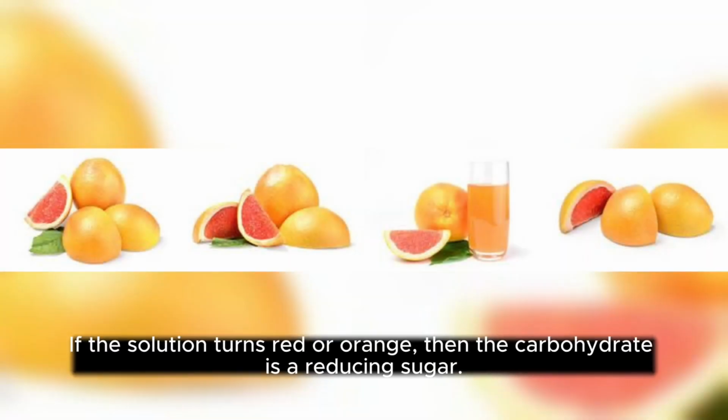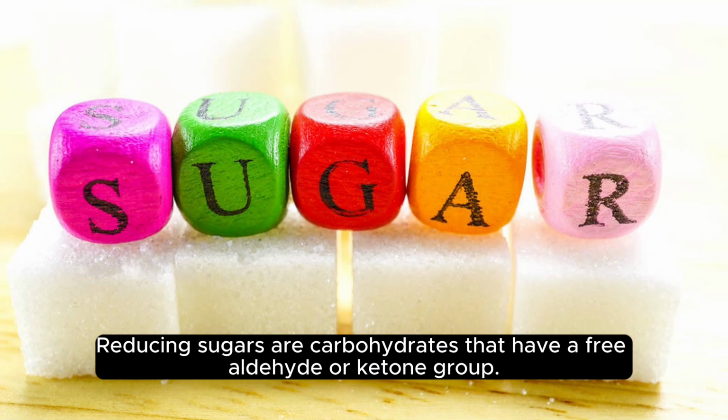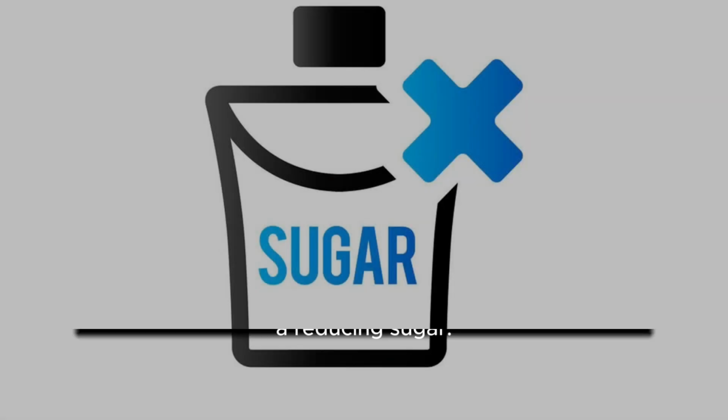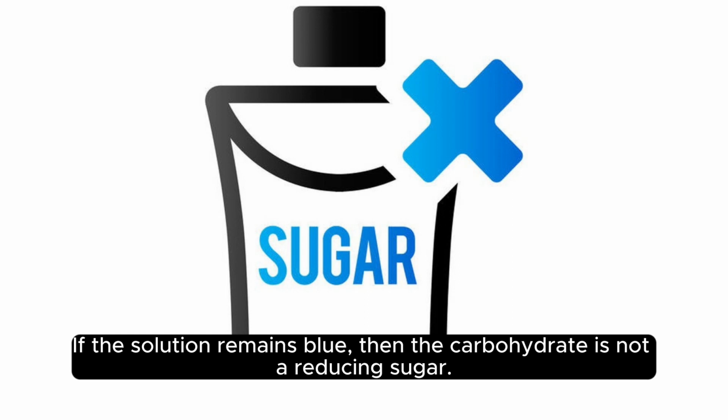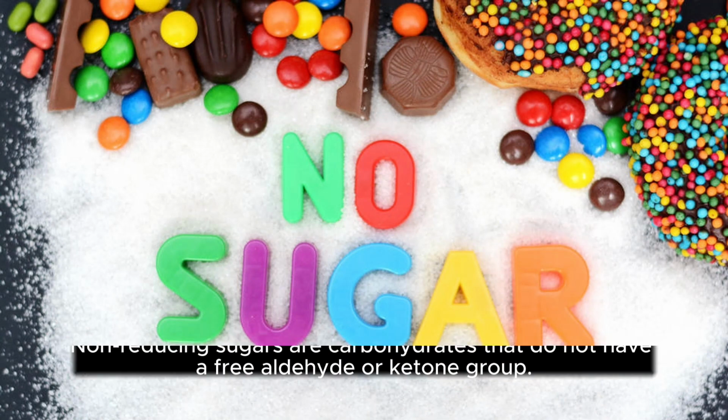Results. If the solution turns red or orange, then the carbohydrate is a reducing sugar. Reducing sugars are carbohydrates that have a free aldehyde or ketone group. If the solution remains blue, then the carbohydrate is not a reducing sugar. Non-reducing sugars are carbohydrates that do not have a free aldehyde or ketone group.